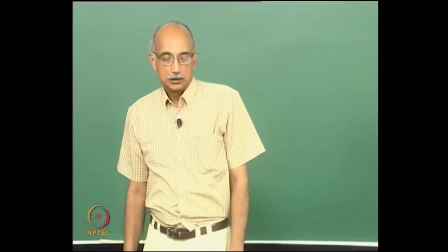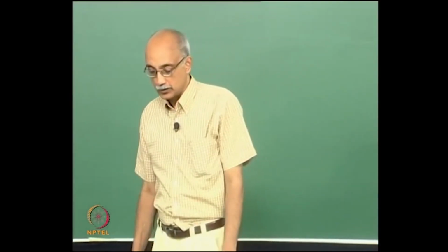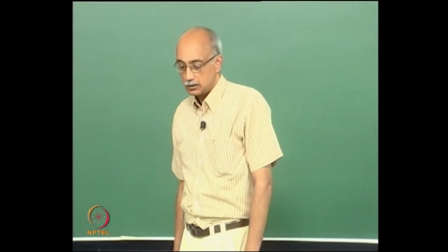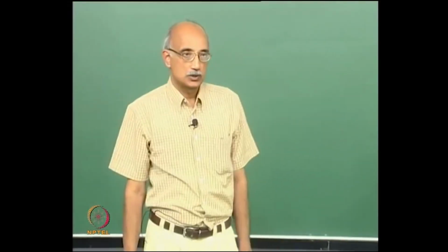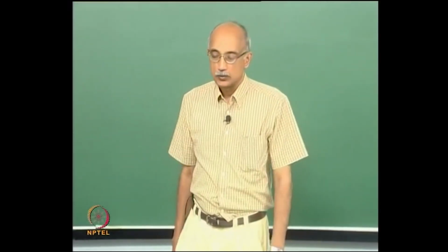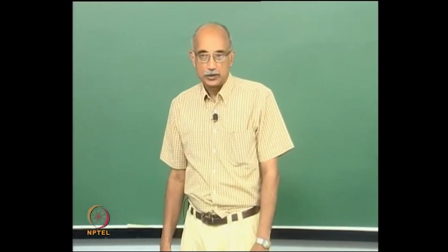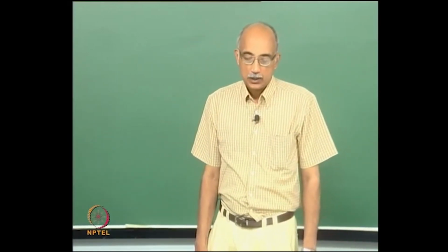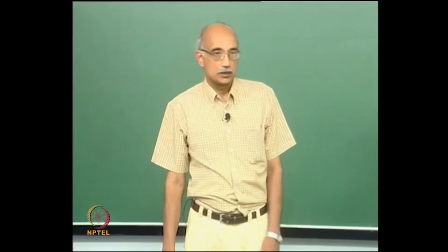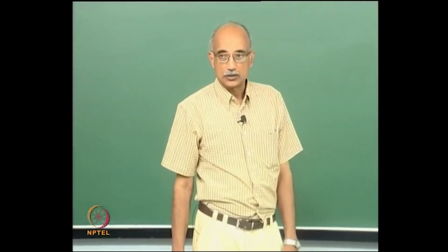Good morning. Welcome to the 12th lecture in our particle characterization course. In the last lecture, we looked at how particle size distributions could be represented as continuous functions and how these continuous functions could then be analyzed to find parameters like mean size and so on. We also looked at a technique that is particularly useful for concentrated suspensions, which is based on acoustic attenuation spectroscopy.